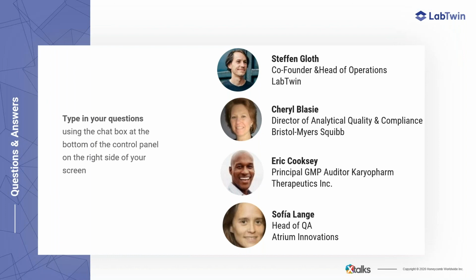Are there any AI solutions that are able to detect data integrity issues with respect to what we're talking about today? Yeah, of course. But before that, I want to give the person who asked the question about contemporaneous just a little hint. The British have a very nice way to explain ALCOA and data integrity. If you just look up on Google the MHRA data integrity guideline, then you find the entire British guideline from the British Medicines and Healthcare products Regulatory Agency for reading about that.